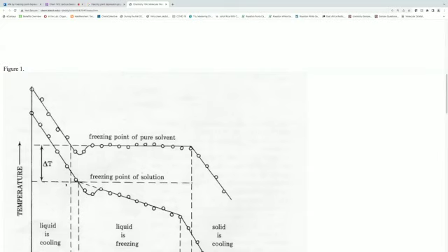It was just hard for me to illustrate that with the graph. When you get the freezing point for the second one and subtract it from the freezing point for the first one, you get a better delta T. It's the gap between the first minus the second one. The reason we had a huge error, 60% error, is because of the way I drew the bottom one.